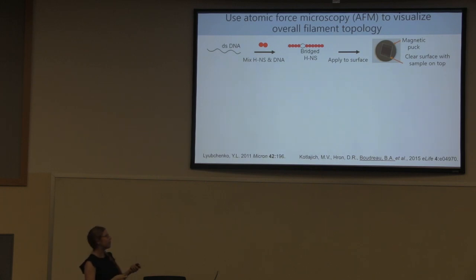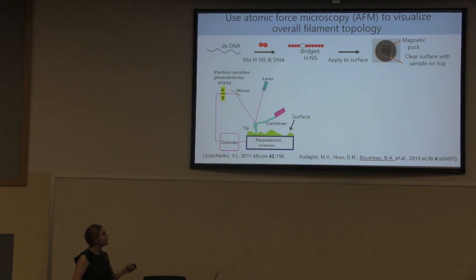You can't see them here with your eyes, but if you put them in the AFM, which looks like this, this instrument will allow us to see any changes in the height of molecules on a surface. So I take this surface here, and I put it in the AFM, and now the surface is this bumpy green blob, my molecules, and there's a tip shown in the blue, which will tap along this surface.